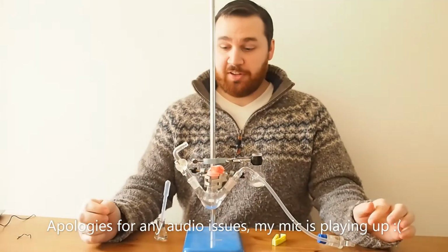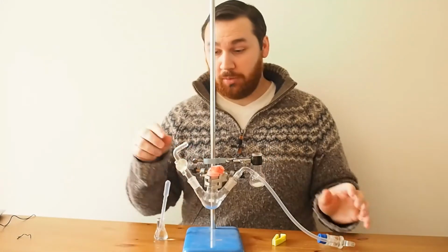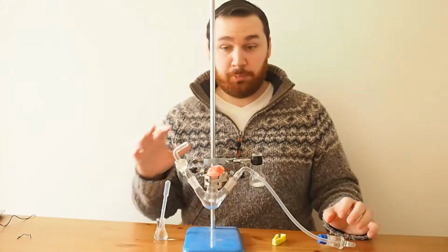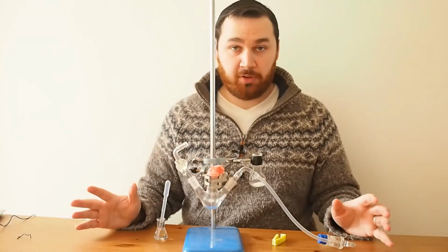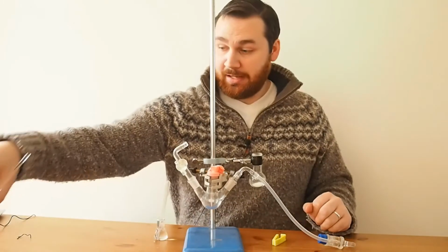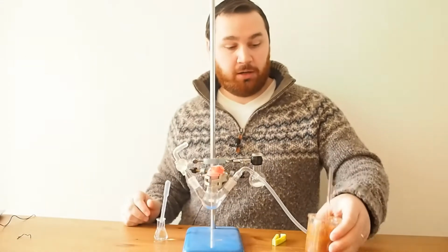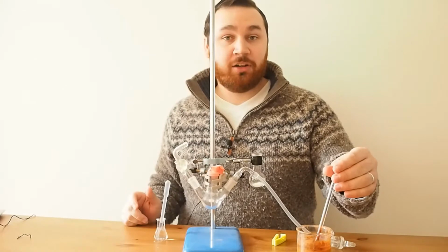In today's video we're going to be doing something a little bit different. I'm going to be showing you how I'm building a little piece of apparatus or equipment to carry out some experiments in the future. Now over here I've got quite a grotty looking beaker with some iron complexes in it.